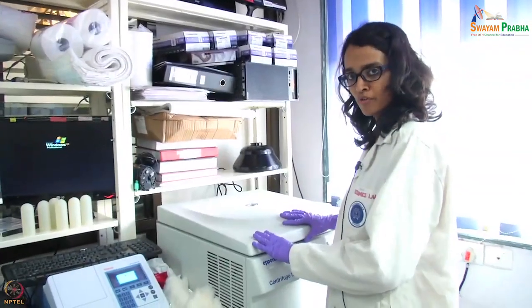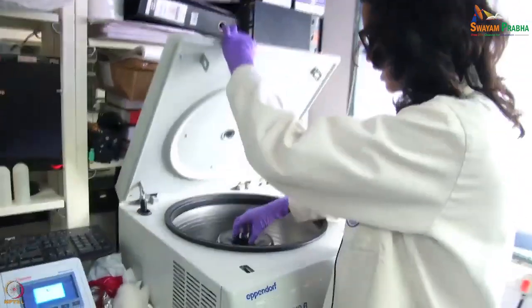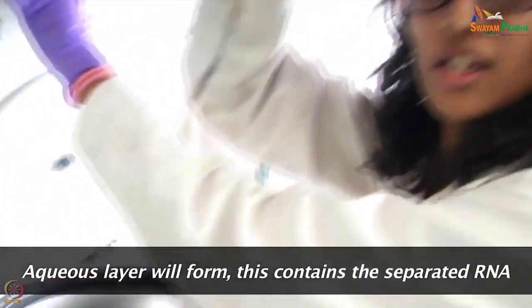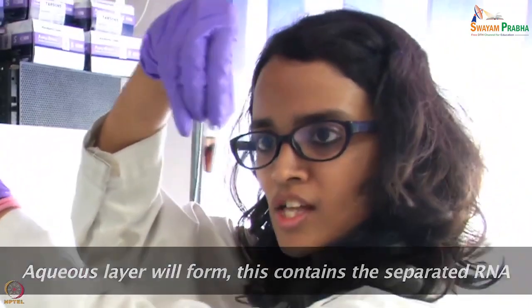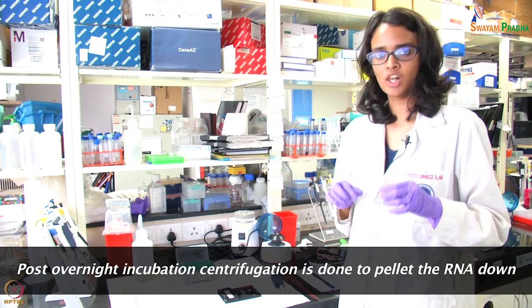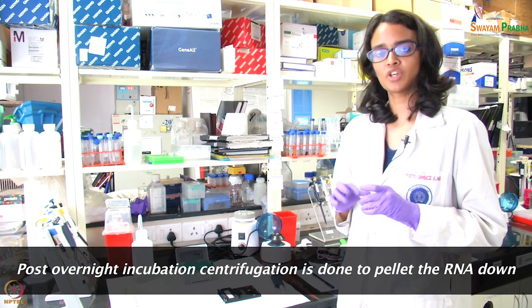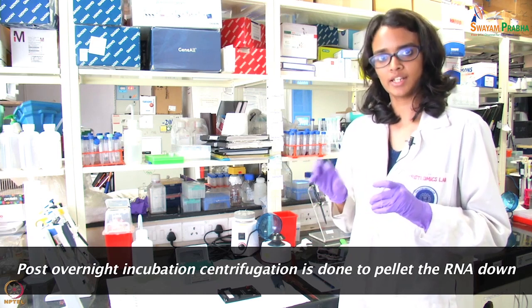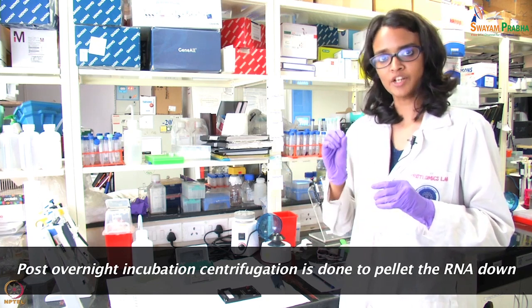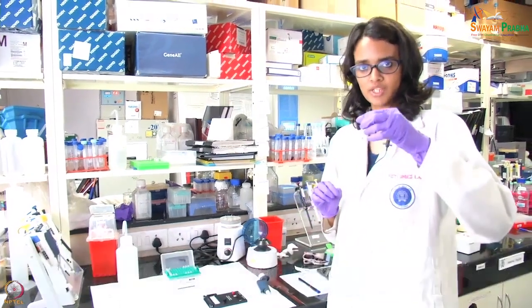After addition of chloroform and centrifuging the tubes, we will now see that an aqueous layer has formed, as you can see. After incubating the samples overnight in isopropanol, the samples were centrifuged at high speed. Centrifugation at high speed will result in the pelleting down of the extracted RNA. The pellet formed is then dissolved in sterile distilled water.